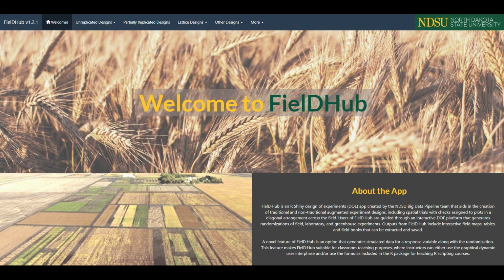Hi, welcome to FielDHub. In this video, I'll show you how to create an experiment with a partially replicated design in FielDHub. We can do this in both the FielDHub app and the FielDHub package for R. A partially replicated design is commonly used in early generation field trials, and can be useful if there's insufficient seed quantity or a large number of entries.